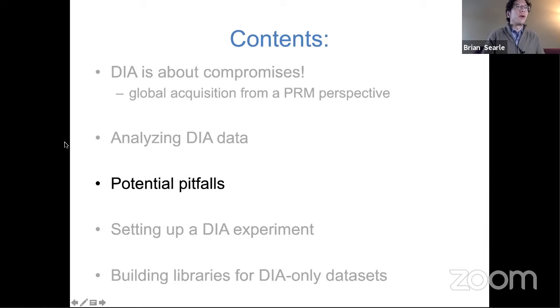We'll get to questions about what is good about the different windows as we go forward. But just to answer Leanne's question about the plus 31 and the plus 50 for the DDA data, these are just the number of peptides that were detected in those different regions. For example, of the 500 peptides that we asked PRM questions for, we were only able to detect about 350 using the best DIA methods, and maybe about 330 using the best DDA methods, in terms of the peptides we felt we could quantify.